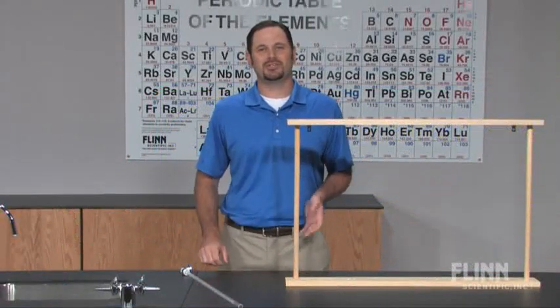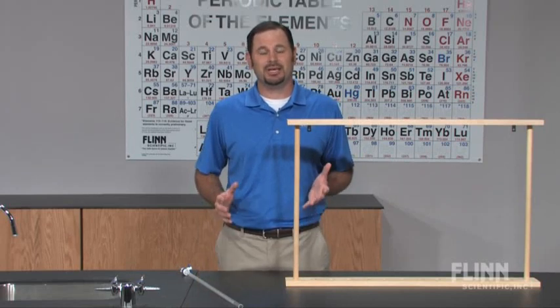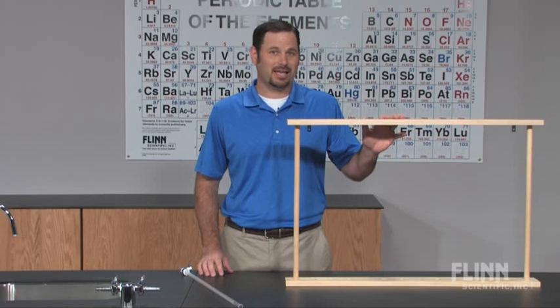Over the years we've heard from many teachers who have told us that storing, transporting, and dispensing burettes is a problem, and Flinn has the solution. The teacher-designed Flinn burette rack.